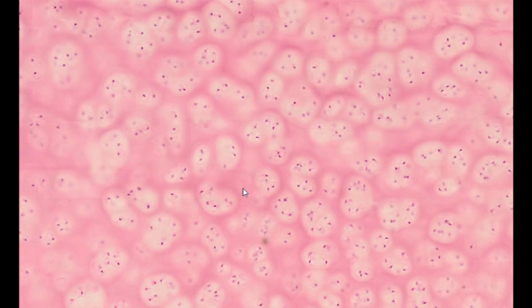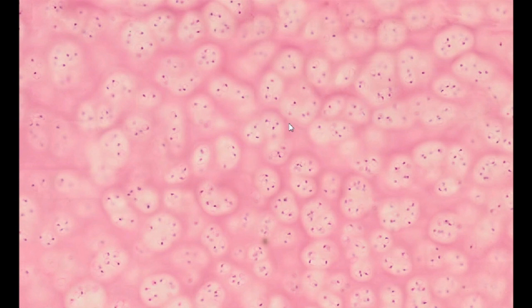The distribution of fibers and matrix in the hyaline cartilage is well organized. The intercellular substance that directly surrounds the lacuna is called the cartilage capsule. It is characterized by strong basophilicity, which enables the identification of the cartilage capsule in the presented staining.